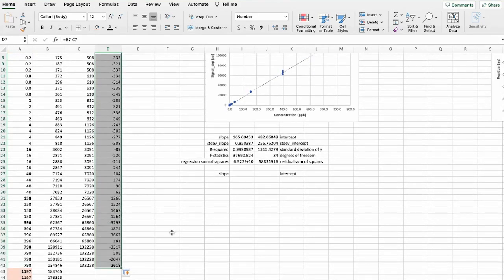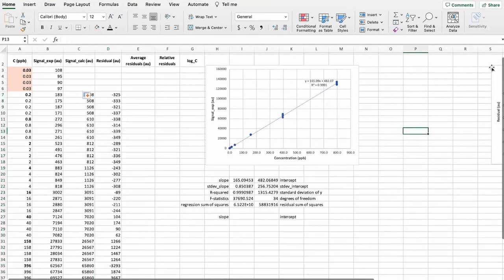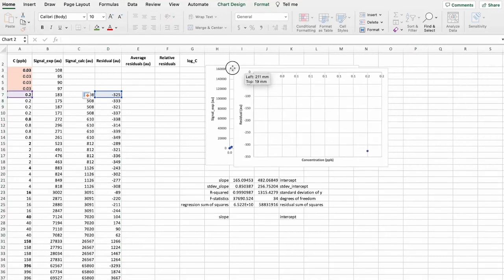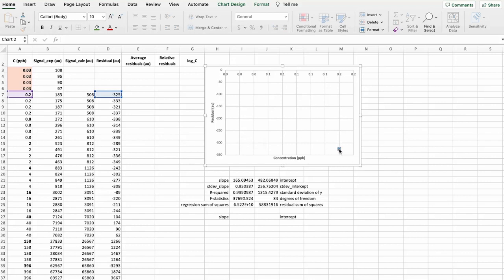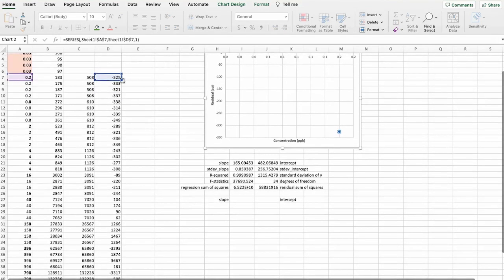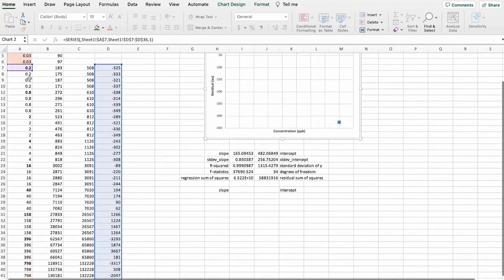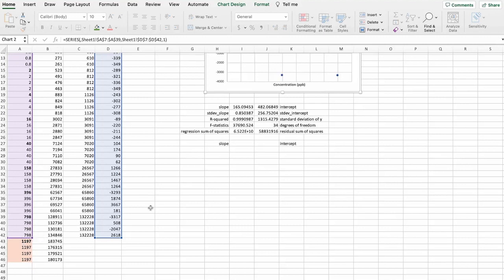And now what we do is we graph the residuals. I've made a graph here. So again, the concentration and the residuals.